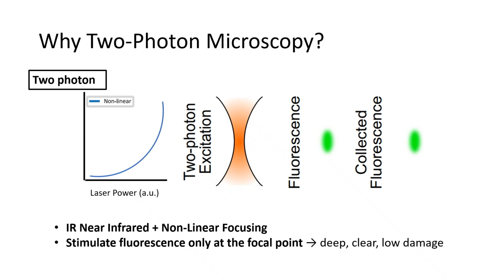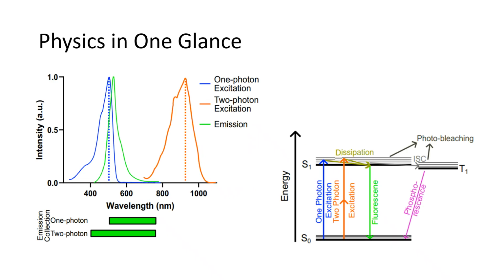micrometers in living brain. The paired brain slice image on this slide contrasts the hazy, shallow single-photon view with a crisp millimeter-scale two-photon view, setting the stage for everything that follows. Let us unpack the mechanism in 60 seconds.